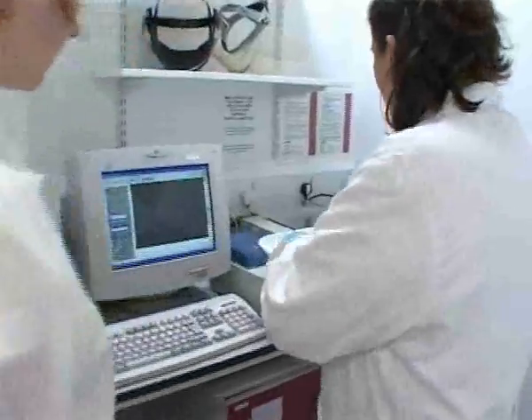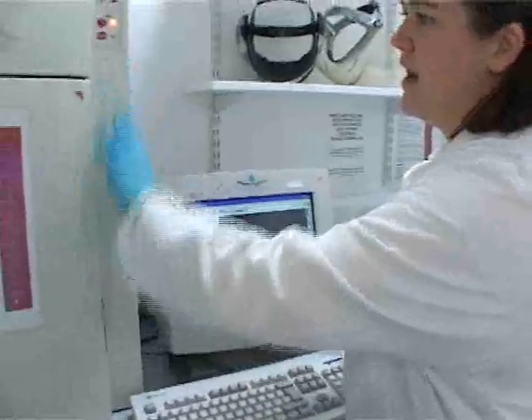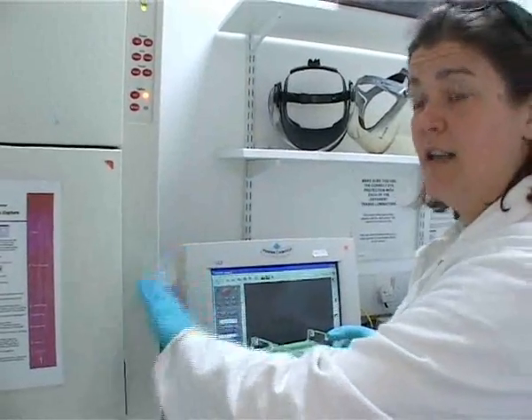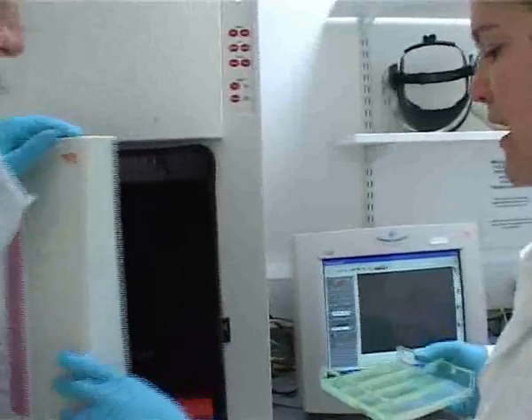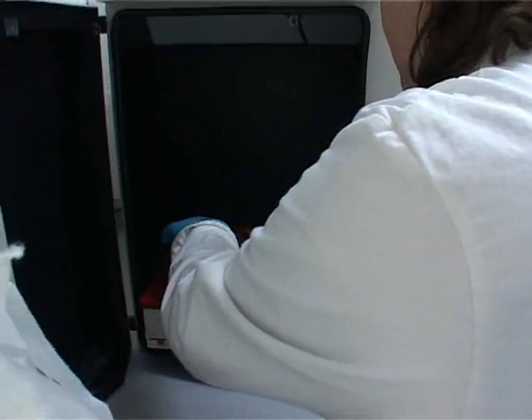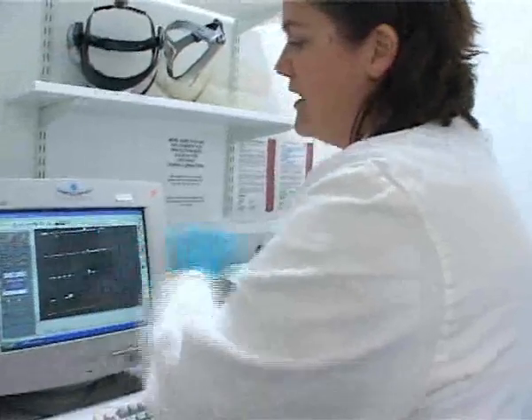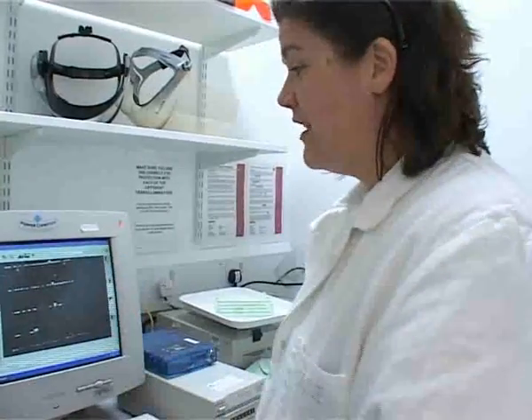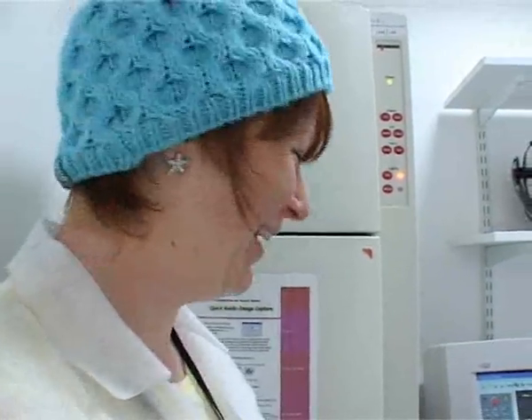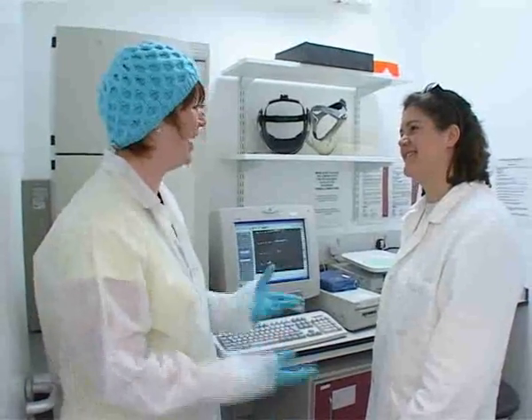So here we are — this is the computerised visual aid for looking at the gels. What we do is all the UV light, because it's very dangerous for your eyes, is actually contained within this machine here. You can see that this plate is an ultraviolet plate, so we just carefully transfer the gel onto there. It looks definitely like we have at least two different species that we collected today, and your DNA worked very well. Well done.